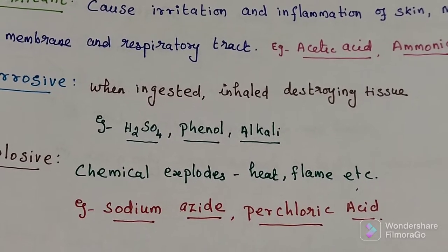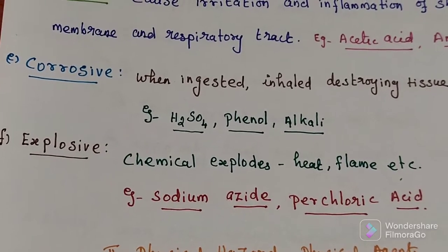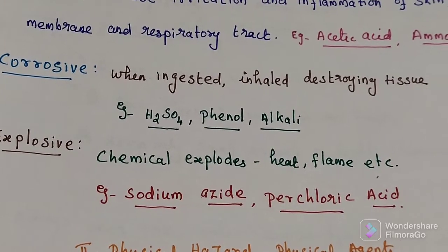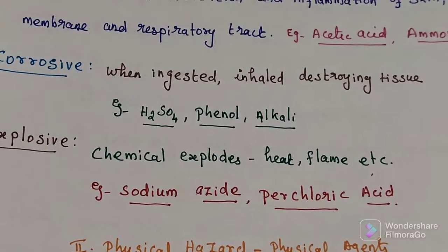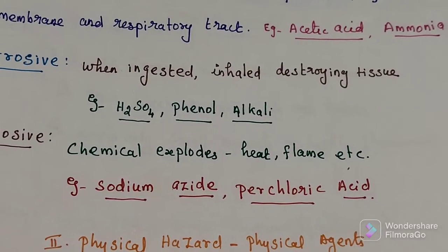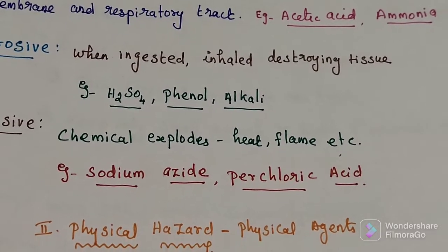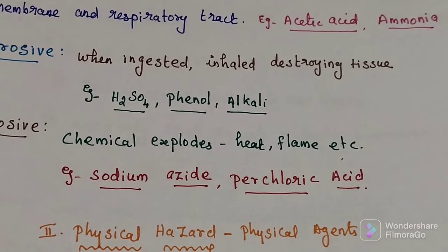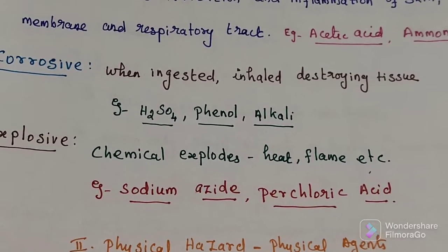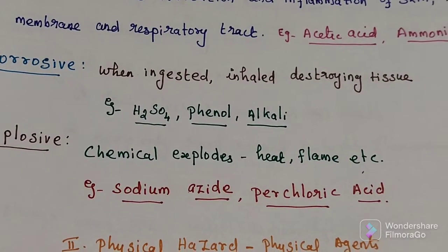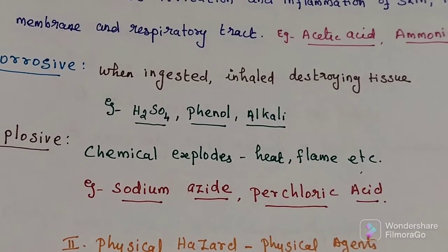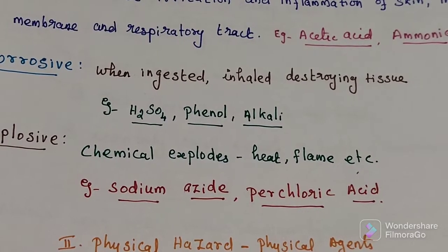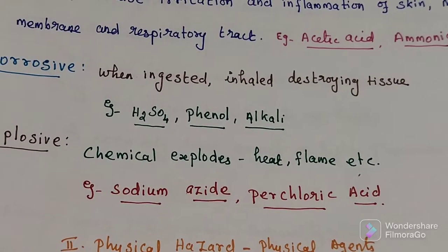The last chemical hazard type is explosive. A chemical which explodes by heat or flame. Examples include sodium azide and perchloric acid.